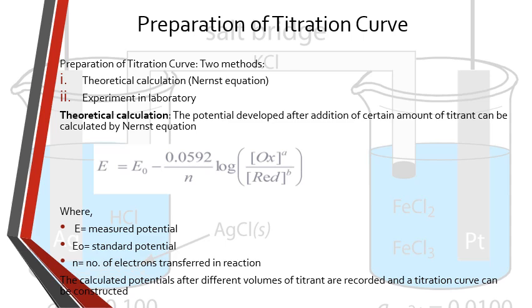Like I said earlier from that slide, that is the titration curve. The curve typically plots the potential, or the pH for the pH metric titration, of the solution versus the volume of the titrant added. Here is how you would prepare and analyze a titration curve, particularly in the context of potentiometry.